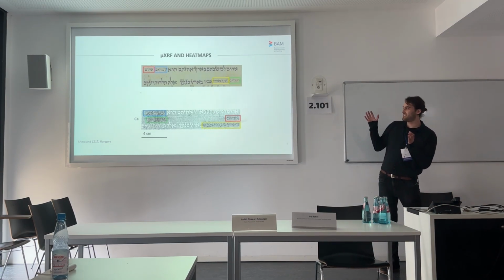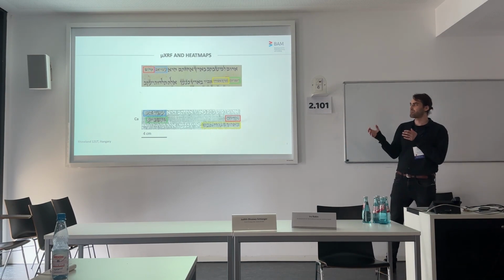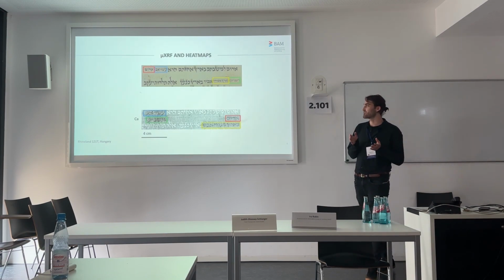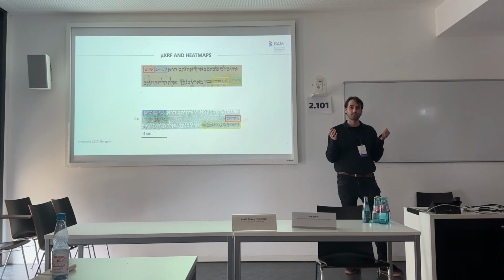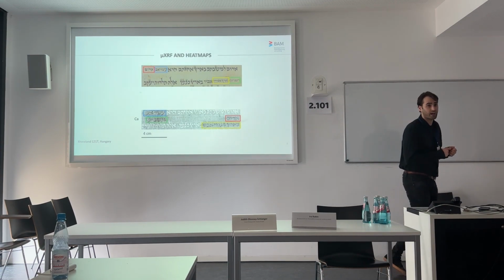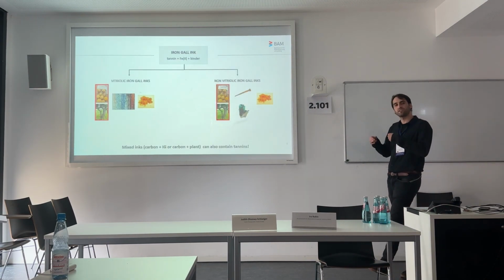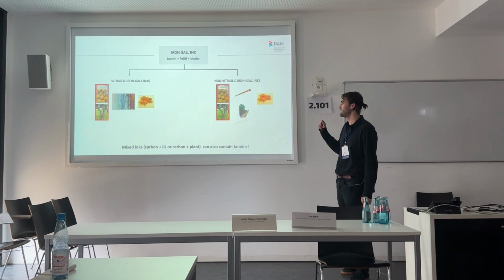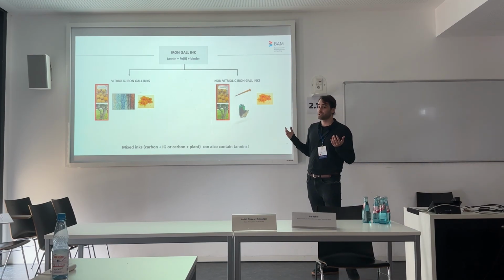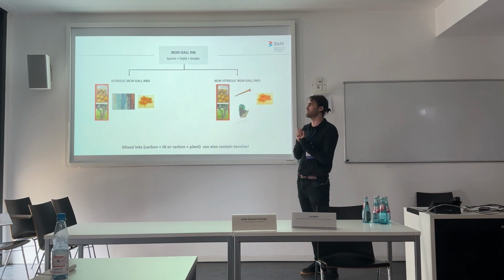With this slide, I'd like to move slightly from non-vitriolic inks towards the topic which was already mentioned by Professor Rabin in her talk, the presence of tannins, another crucial ingredient of inks, the organic part of inks. And as she already mentioned, very difficult to identify and to compare. First, let's have a look again at the already familiar chart where we see those two different types of inks. As I mentioned, to source the acids, the phenolic acids for the production of inks, basically two different historic sources could be used.